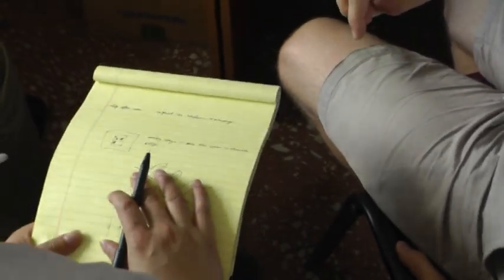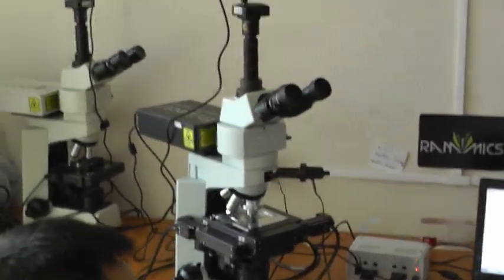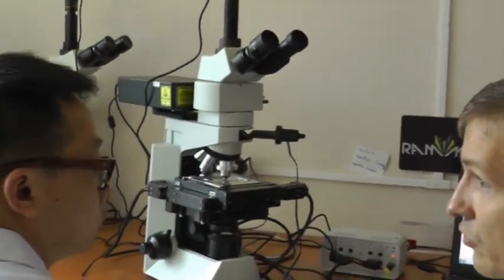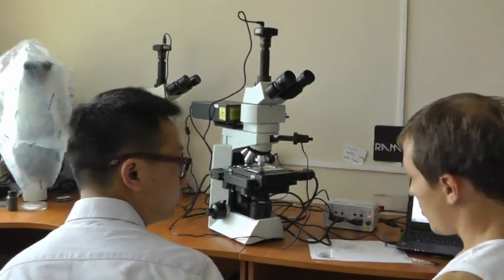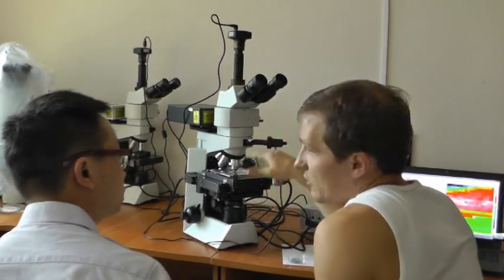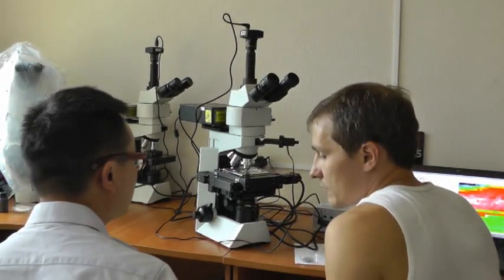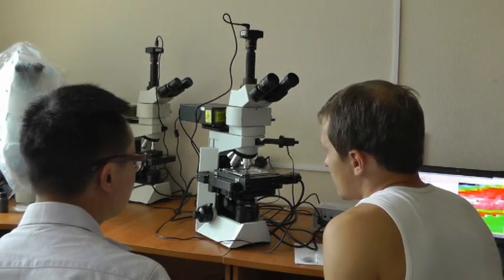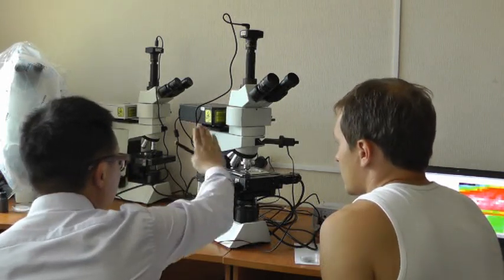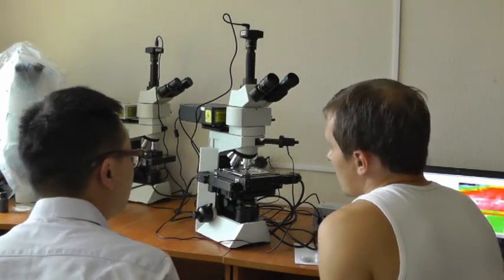You mean that there are microscopes working with convergent beams, right? Yes. Okay, our device is designed for infinity-corrected systems. I said in my acknowledgement there have to be two points to check: if there's an infinite system, and if there's anything like a beam splitter at this point, which maybe cannot be removed.